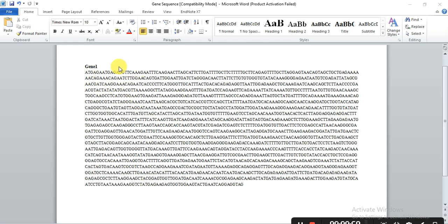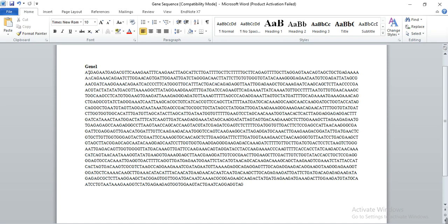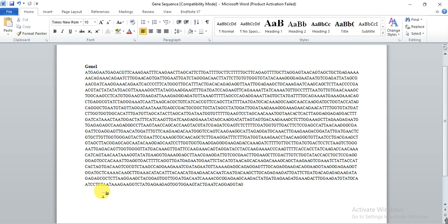So first I need to make the forward primer and the forward primer is the sequence from the start to end. So I take about 22 base pairs from ATG - that is 1, 2, 3, 4, 5, 6, 7, 8, 9, 10, 11, 12, 13, 14... 22 or 20, okay - and copy it. And then write here gene forward, gene the forward primer, and paste.